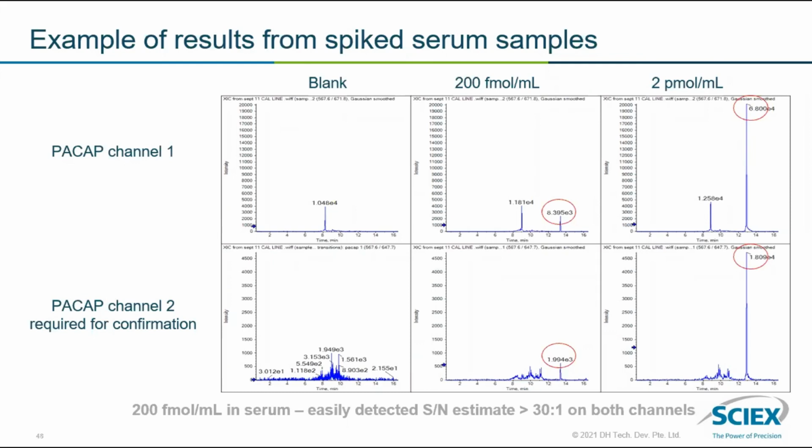rinsing steps. I just wanted to show you this example because method development activity is also possible in the case of CESI-MS. And if you have a challenging sample like serum or plasma samples, you can optimize the methods. So these additional peaks are basically due to the serum, and they may have caused problems in radioimmunoassay technology. But in the case of CE, if you enhance the rinsing steps, you will not get this kind of profile in challenging samples.